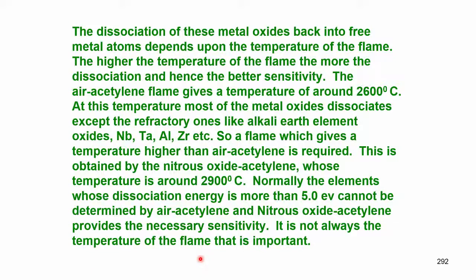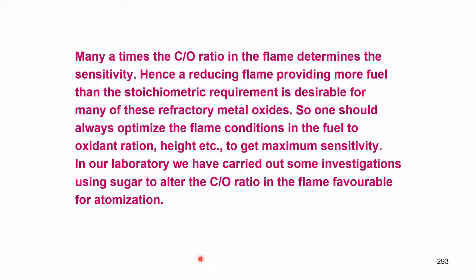It is not always the temperature of the flame that is important. Basically, what it means is quite often the ratio of carbon to oxygen in the flame determines the sensitivity. So, a reducing flame that provides more fuel than stoichiometric requirement is desirable. That means, for refractory metals, what we need is a reducing flame. Why? Because they are all oxides.